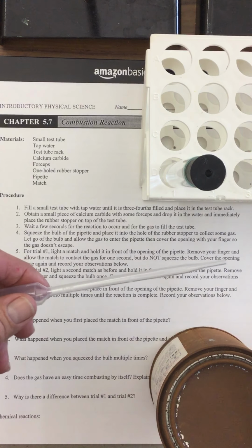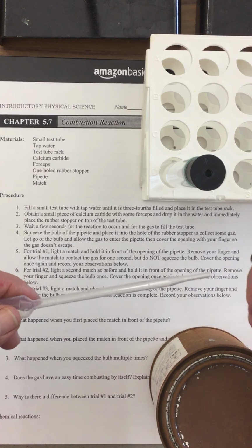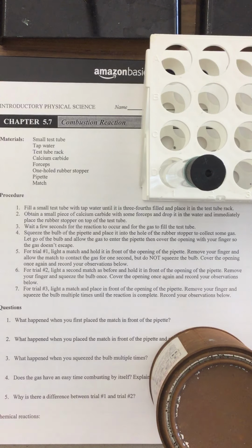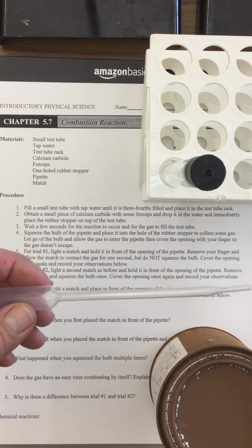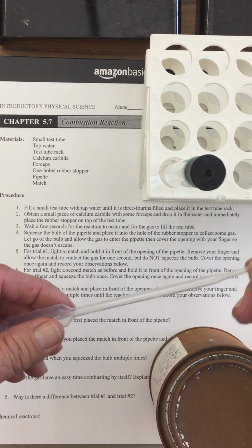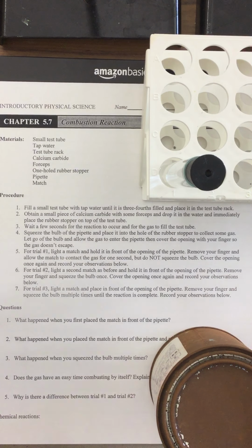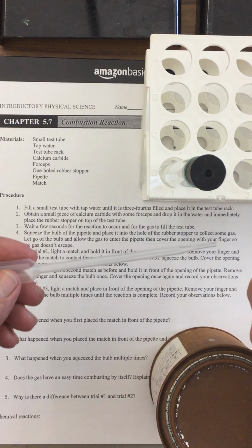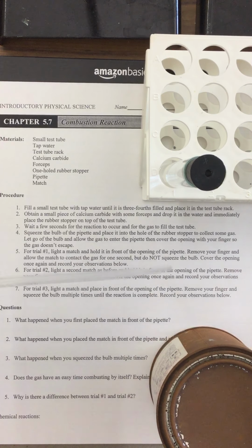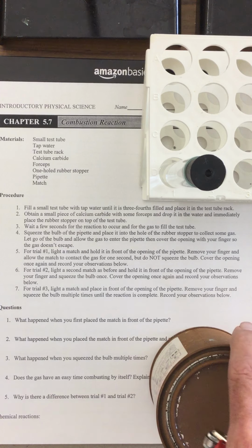Trial 1, I'm just going to take this pipette and I'm going to take the lighter and see what happens when I combine the lighter with this gas. We'll record the results, but I'm not going to squeeze any of the gas out. We're going to see, does the gas get lit by just putting the flame right next to the pipette. The second trial is I'm going to hold the lighter in front of this and I'm going to give a light squeeze to this and we'll see what happens. The third one, I'm going to squeeze in and out multiple times to see what happens as well.